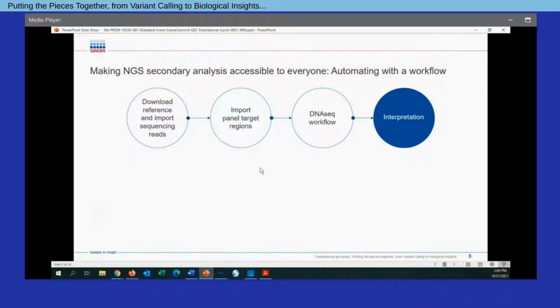Then when we talk about specific targeted sequencing, obviously there is regional information that we're going to want to bring into the software as well. So we're going to want to import our panel-specific information. And then from there, what we're going to discuss is the DNA-seq workflow itself, which will take us essentially in a single dialogue to do all the processing necessary to move from FASTQ files to called accurate variants. And then from there, we can parlay into interpretation.